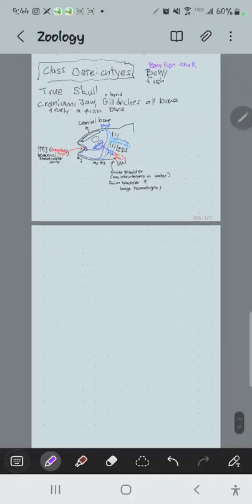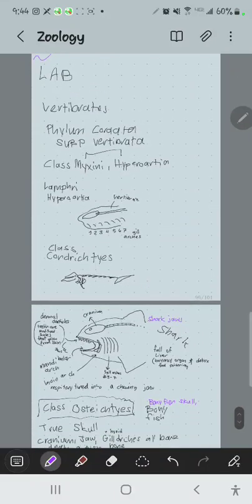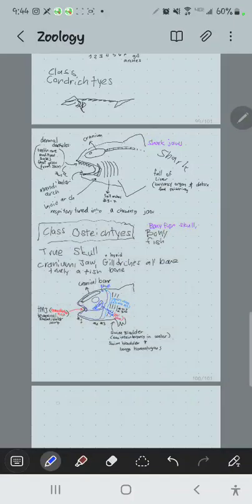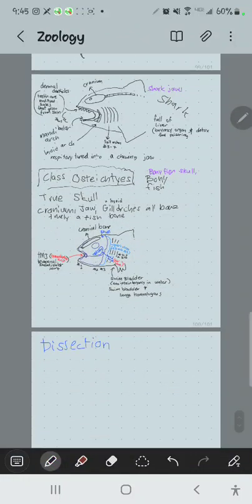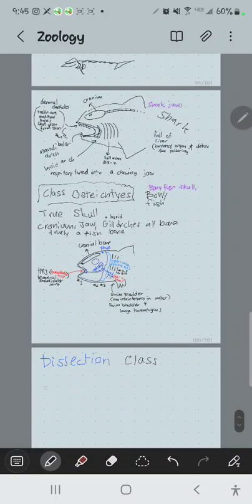These are dogfish sharks. Their main prey is soft-bodied mollusks, like sea slugs or really soft-shell crabs, like molting crabs. So you can see that the teeth on these dogfish sharks are not really sharp, slashing teeth. They're more like crushing teeth. They're feeding on soft crustaceans and maybe some polychaete worms like that.